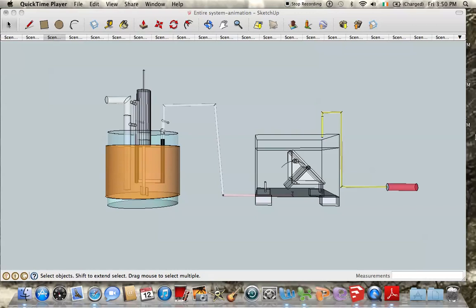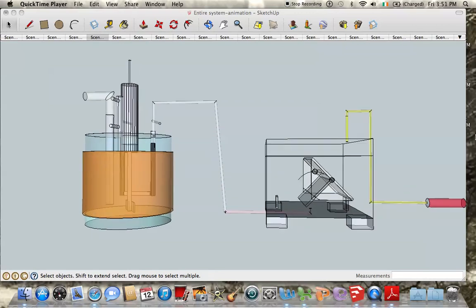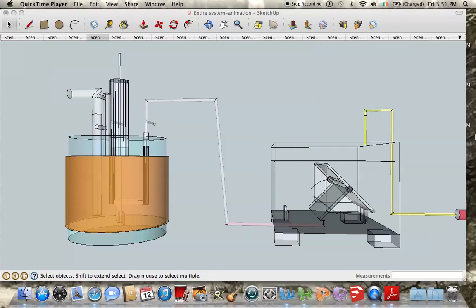Anaerobic digestion is the breakdown of organic material by bacteria to produce biogas. Biogas consists of approximately 60% methane and 40% carbon dioxide, and it is the methane that we are interested in. Once the gas is produced, it can be upgraded and sold back into the national gas grid. It can be used to generate electricity, which can be sold back into the electricity grid, or it can be used to produce vehicle transport fuel.